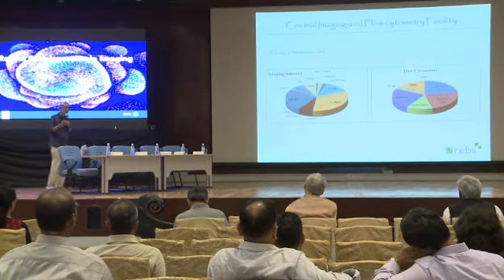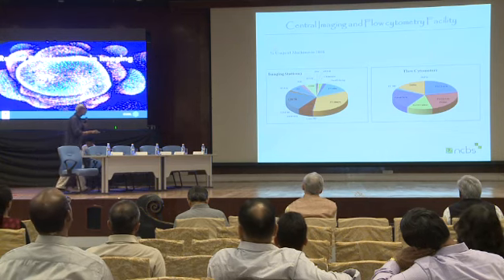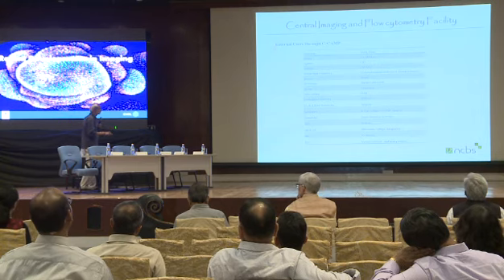Next slide, please. So this is how each of our microscopes are used. This is the percentage. Of course, the point scanning confocals are always heavily used compared to all other specialized microscopes. And these are how flow cytometers are used. Next slide, please. And there are so many institutions. Actually, Taslim says it's more than 100 institutes right now using our facility.